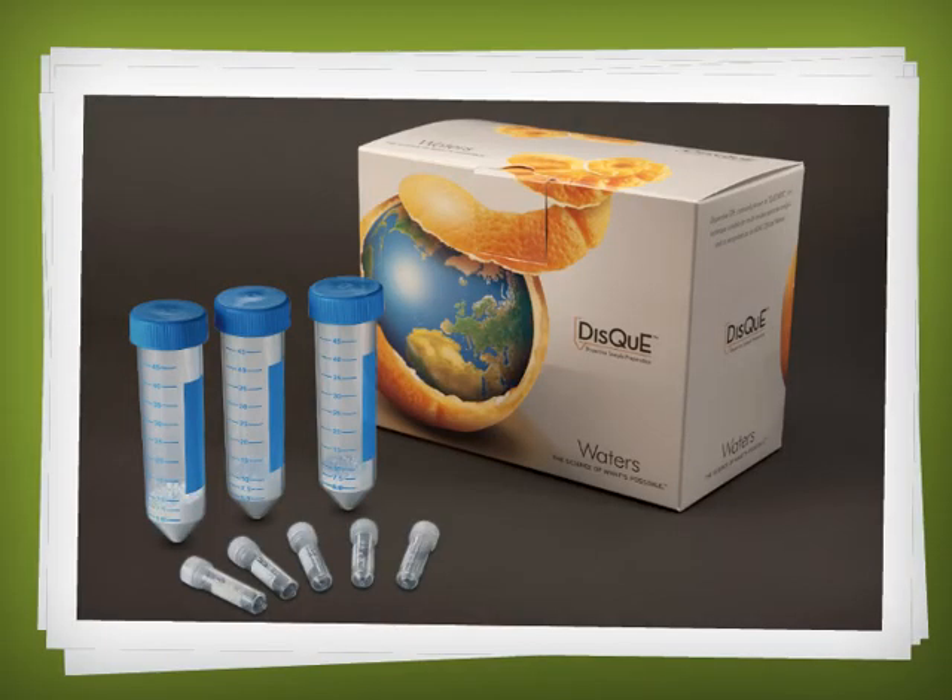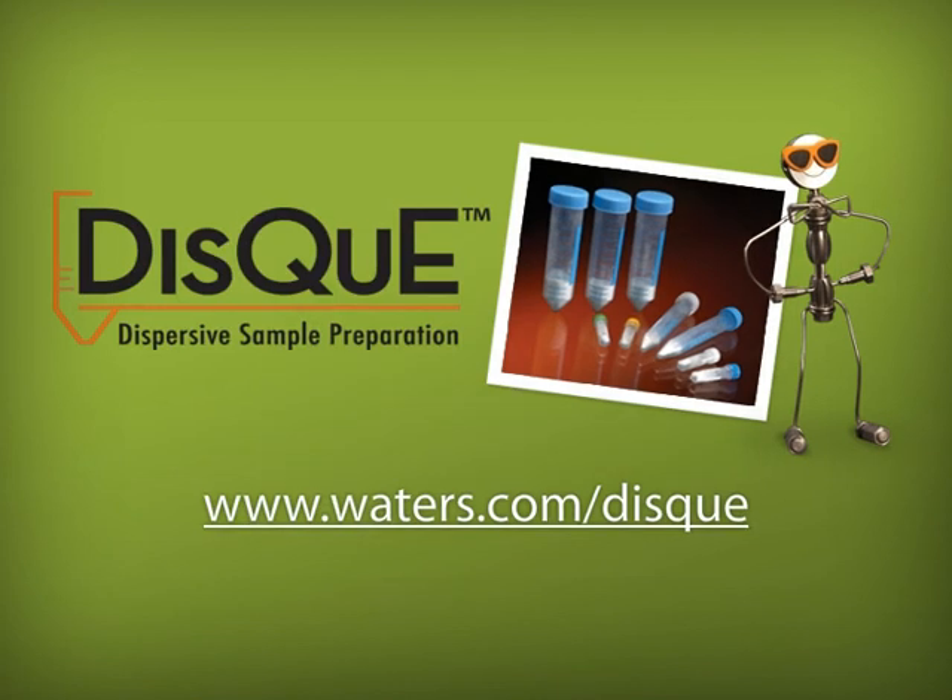Are you ready for the next sample? There's no easier way to get the job done. Waters DisQuE dispersive sample preparation kits conform to official regulatory methods and are manufactured to the highest standards. Experience the simplicity of the QuEChERS method — order online today.